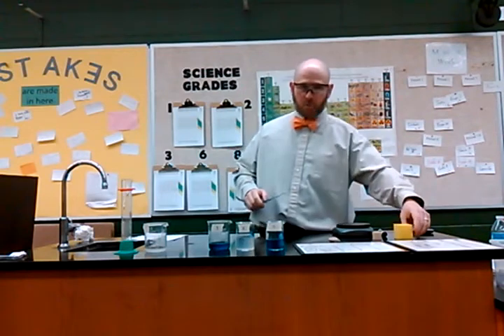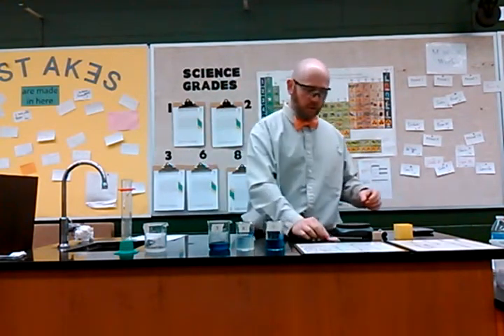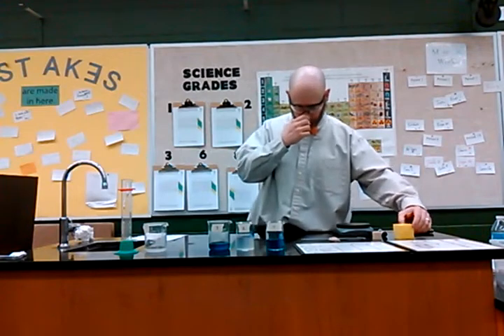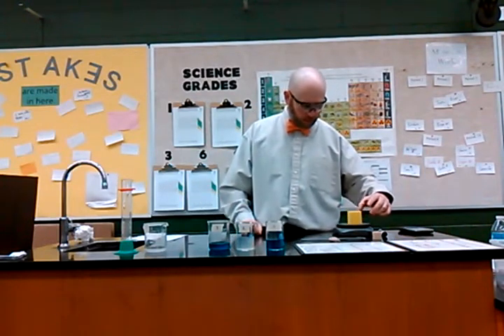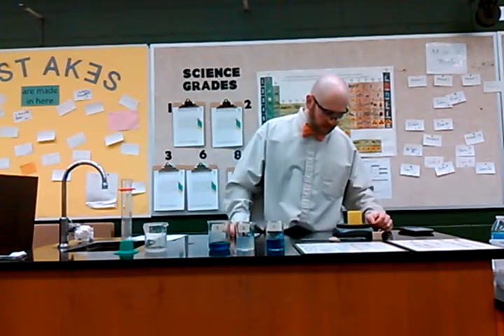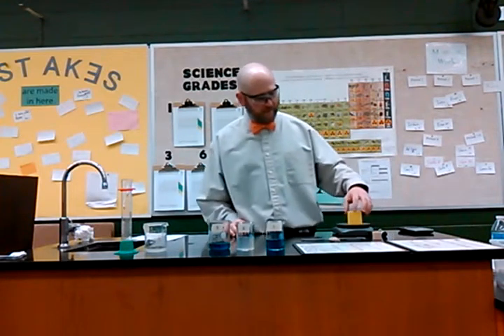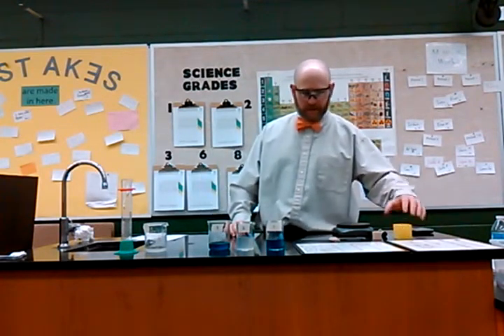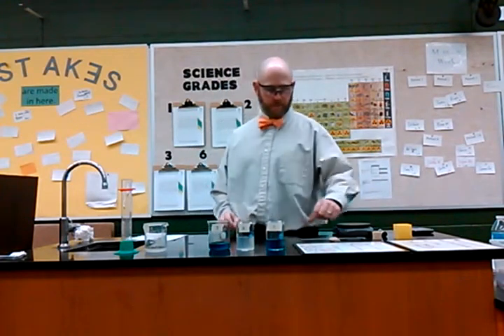To calculate the volume, I would multiply those three numbers together to get the cubic centimeters. Here, I have the foam block on the scale, and it weighs 12 grams. So now that I have the mass and the volume calculated, I can determine these objects' density.